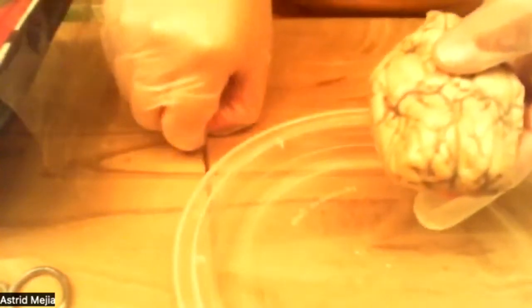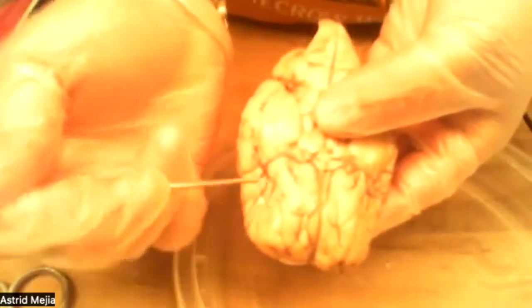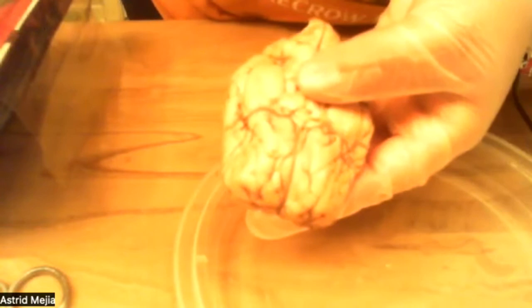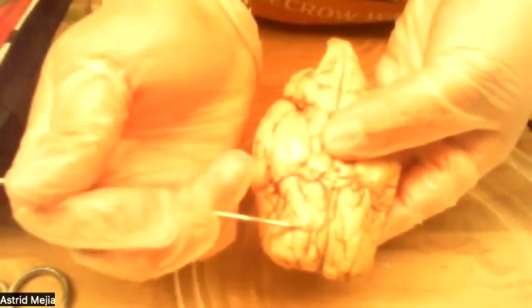It contains several types of nerve cells that are involved in the sense of smell. And then the olfactory tract is going to be this part right here. If you can see it very clearly, it will be this part of the olfactory tract.